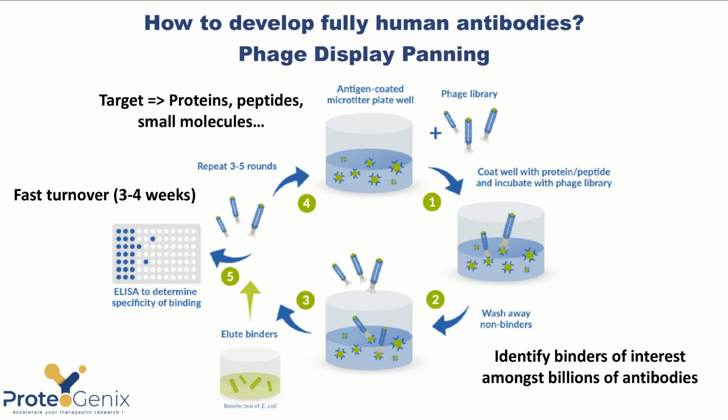This is in order to identify the ideal middle ground between enrichment and sequence diversity in order to be able to propose several binders against the target. If we do not do enough rounds of panning, enrichment will not be detectable, while if we do too many, a very select few sequences will dominate the enriched phage pool, thus lowering the diversity of binders obtained.